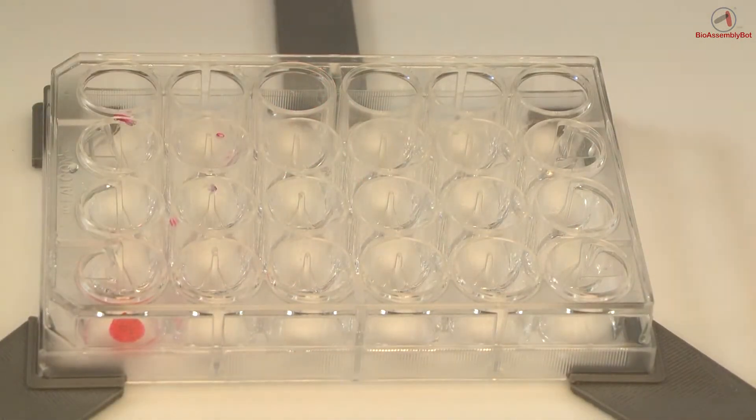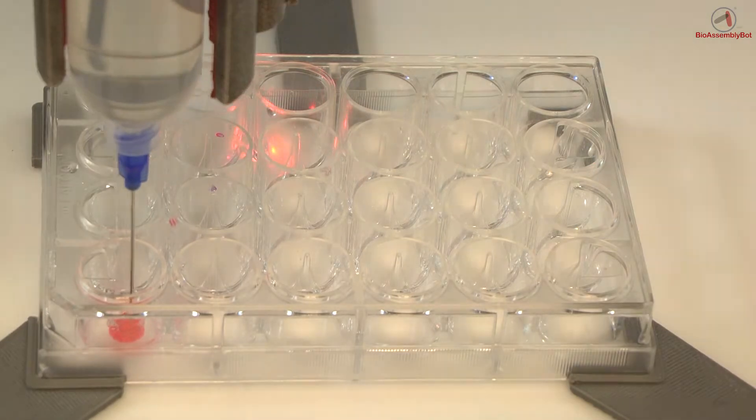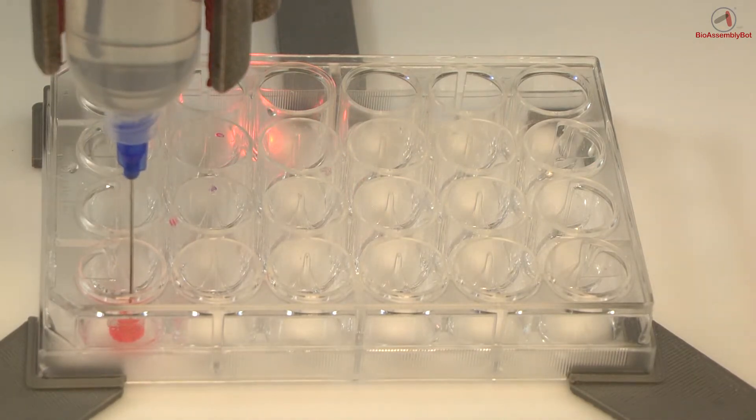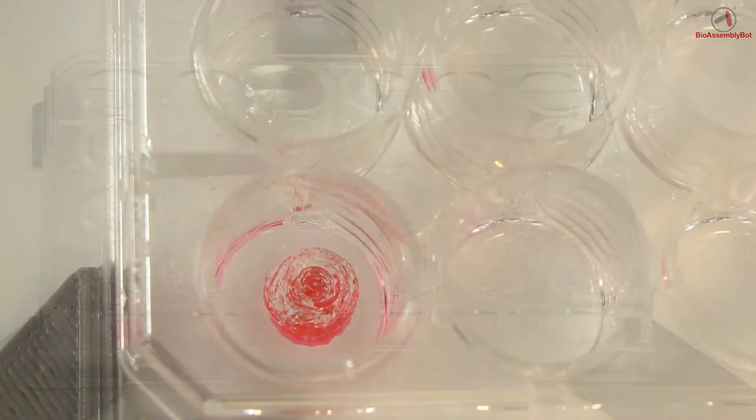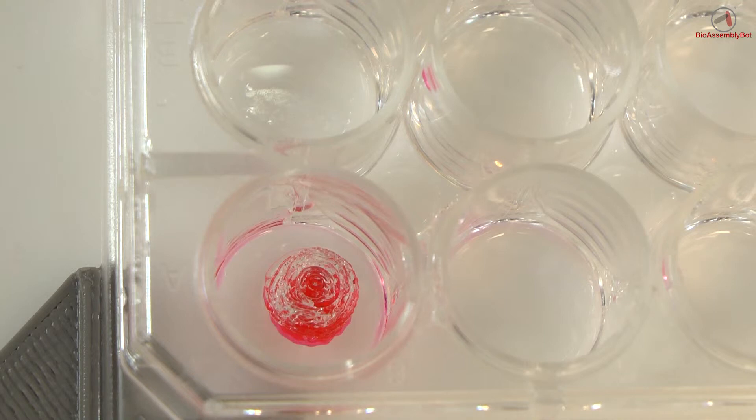But in this case, they are stacked one on top of each other - for example, kidney epithelium below with kidney stromal cells above. Again, it's ideally suited for a number of different assays, and different structures can be printed throughout the wells of the plate.